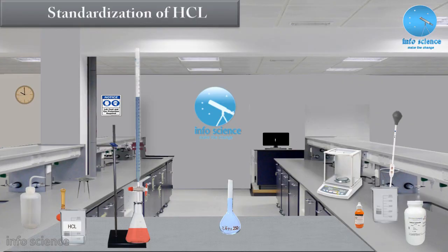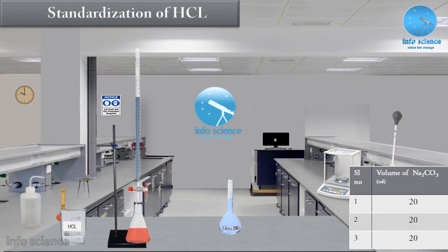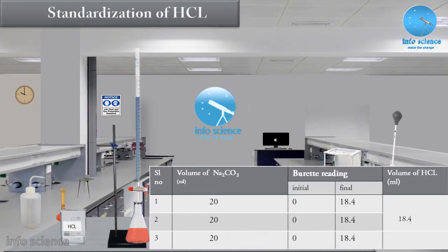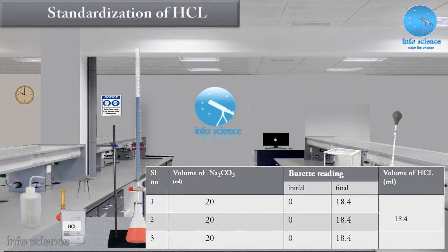Repeat the titration process 2 to 3 times and record the results in tabular form. The initial reading and the volume of HCl solution used is 18.4 ml. Keep this data for the next calculation step.